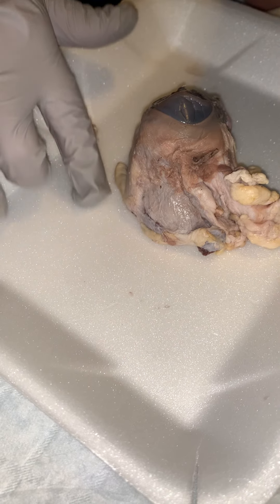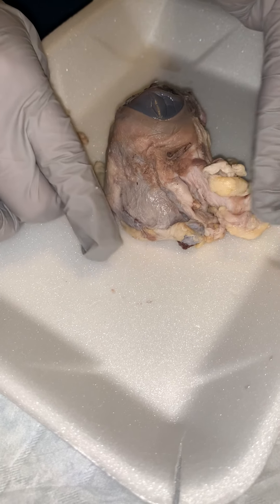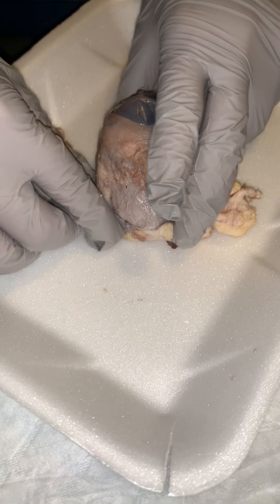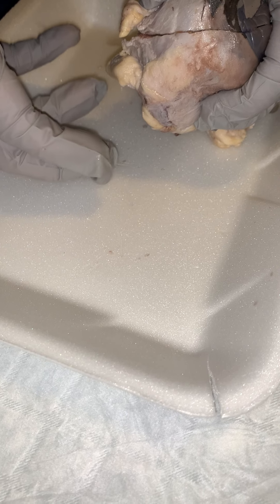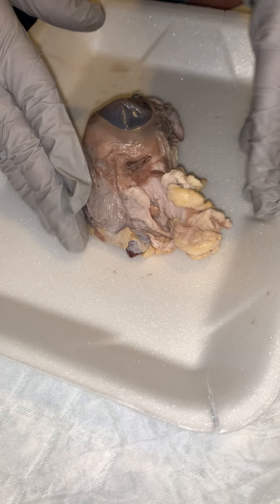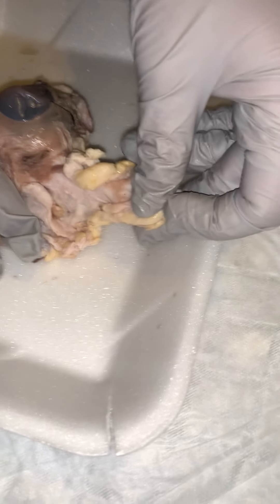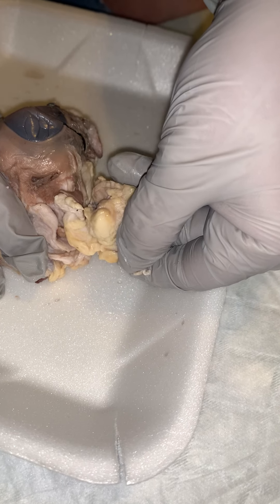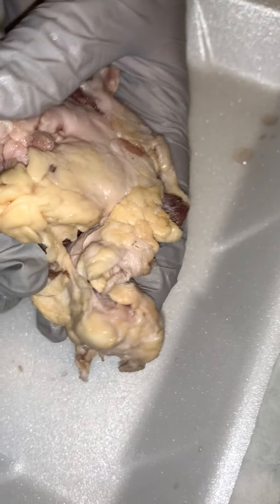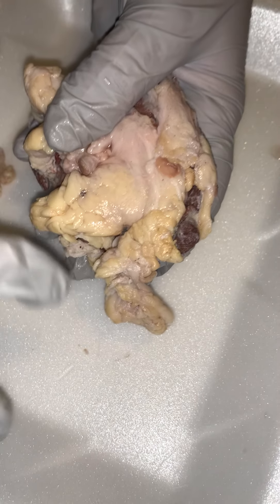Starting on the outside, we have our fibrous connective tissue and we also have our external muscles. Our external muscles are going to help move the eye when it's in the orbit, and the connective and fatty tissues are going to help keep it in place. Here's a good example — a big chunk of fatty connective tissue. The outermost layer is the fibrous tunic, and that is the outermost, toughest layer.